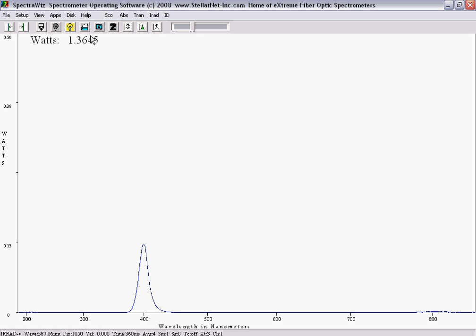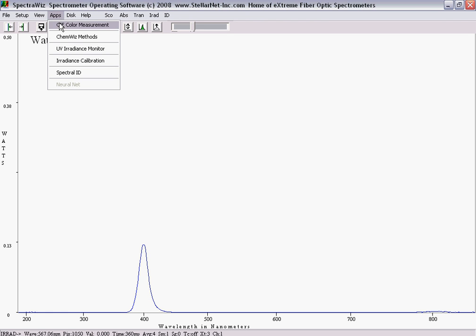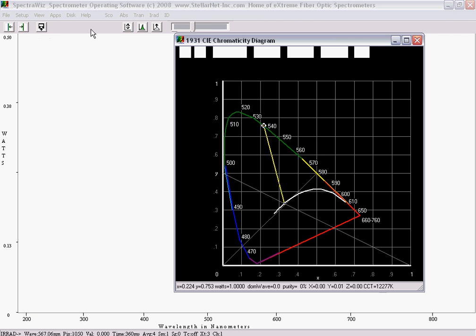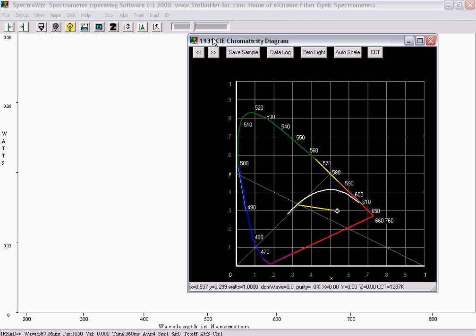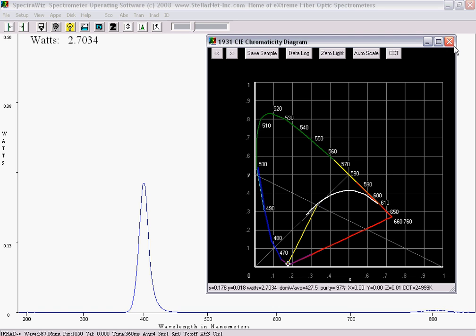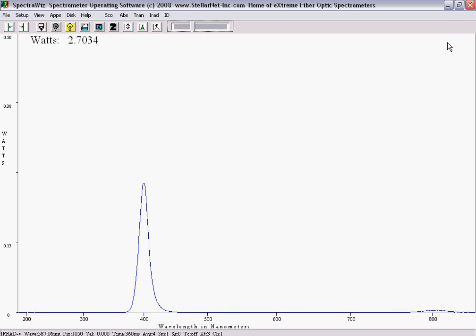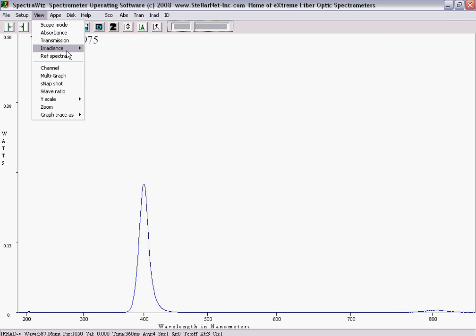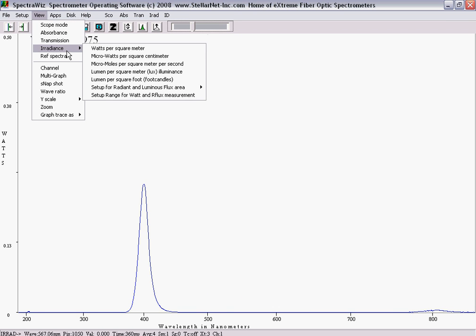You may then select the CIE color monitor from the apps menu. Other data modes can be found in the view menu as well.